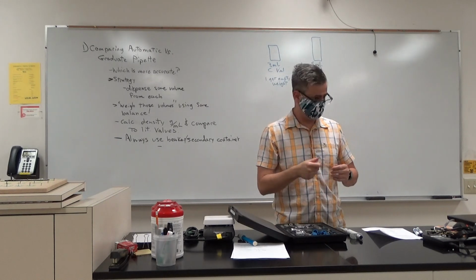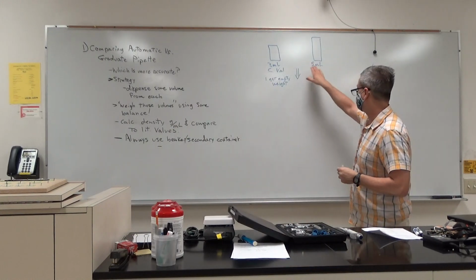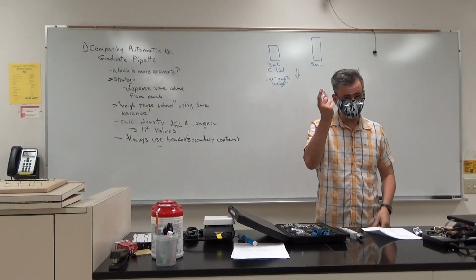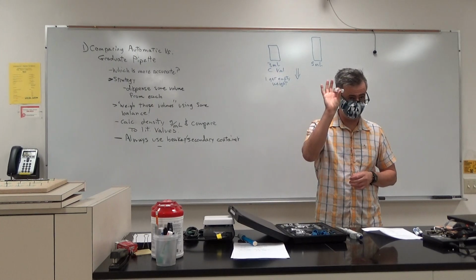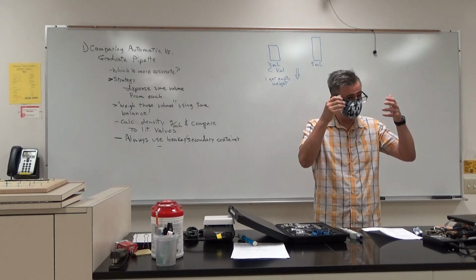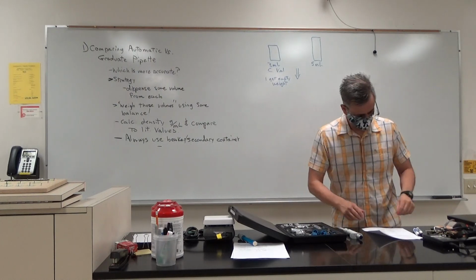I can put a paper towel in there, roll it up a little bit, and that pre-weight that I had will still be good. If you put water in these, you can sit there with a paper towel all you want, but there's still water adhered to the glass that changes the mass. So if you do the hexane first for both of them, then you don't have to get a second empty weight.